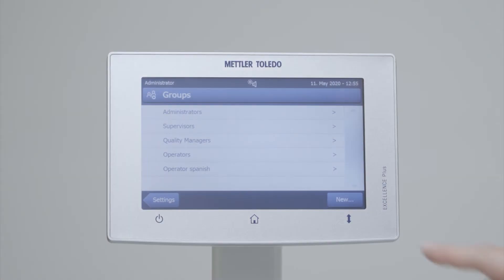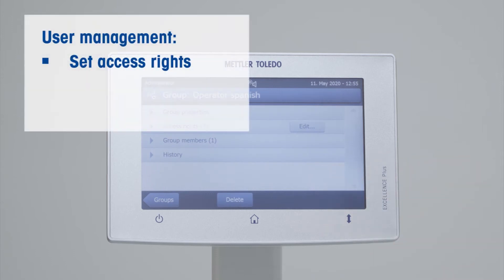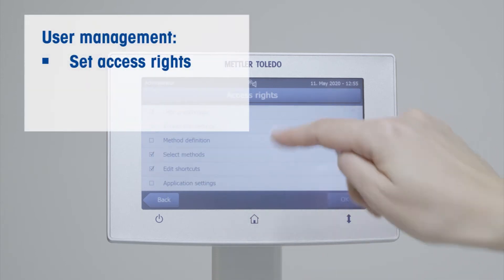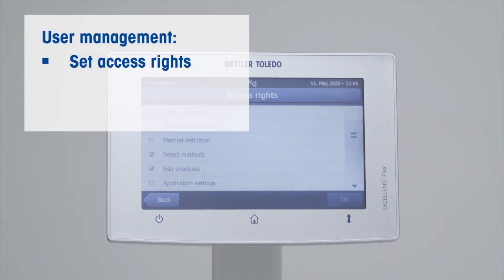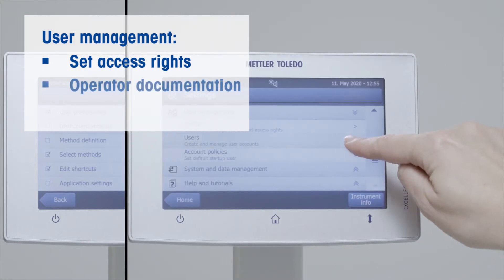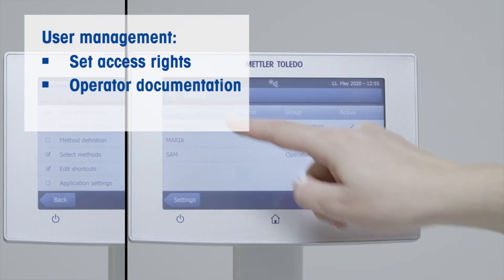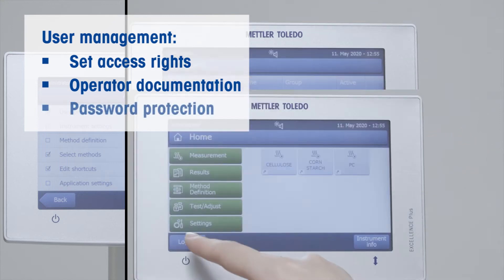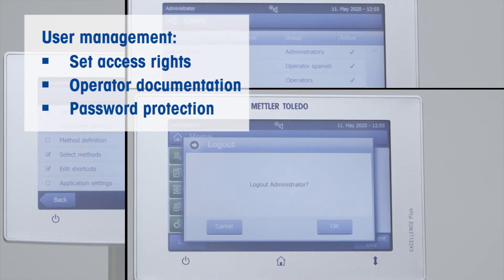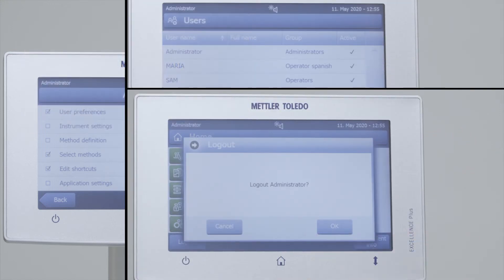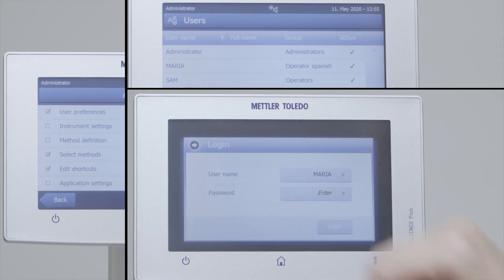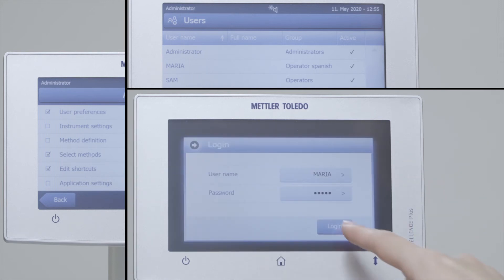User management allows you to define access rights for each user group and to prevent accidental setting changes. It can be directly documented who has done the measurement, and a password can be set for each of the user accounts. This is possible on the Mettler Toledo Moisture Analyzers HS153 and HX204.